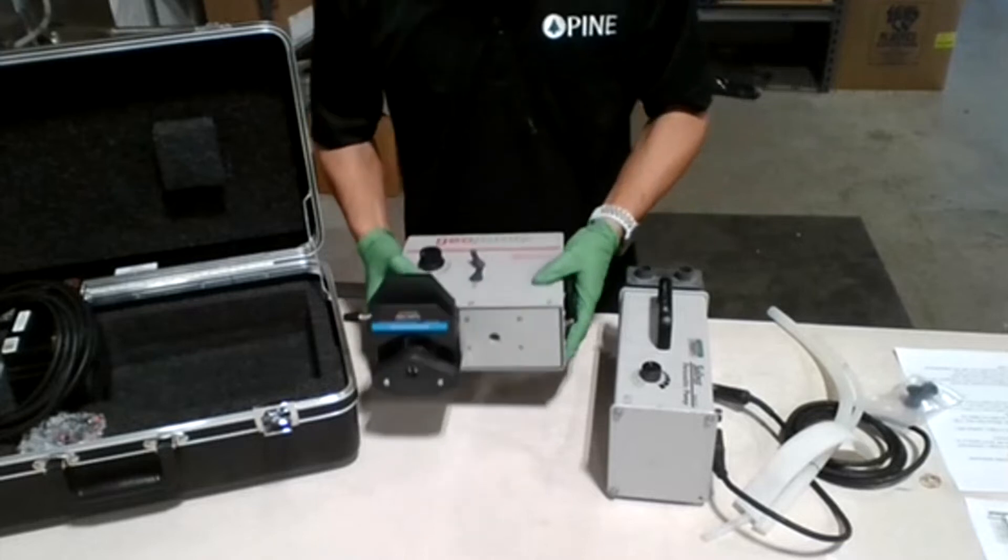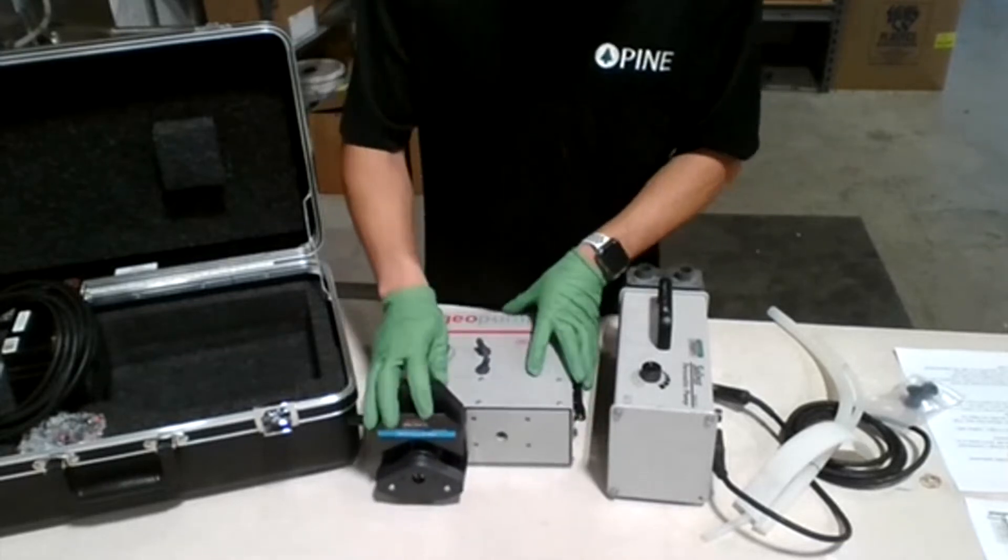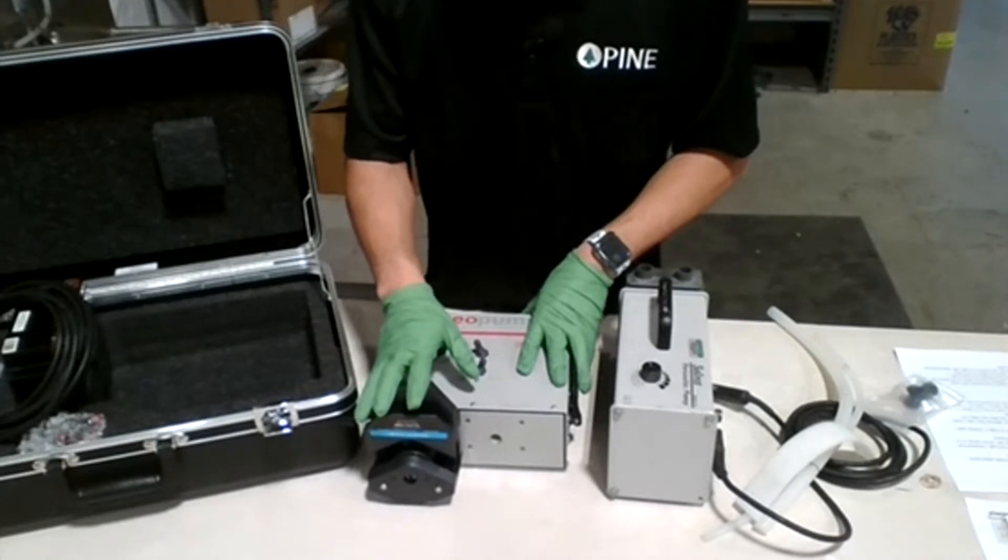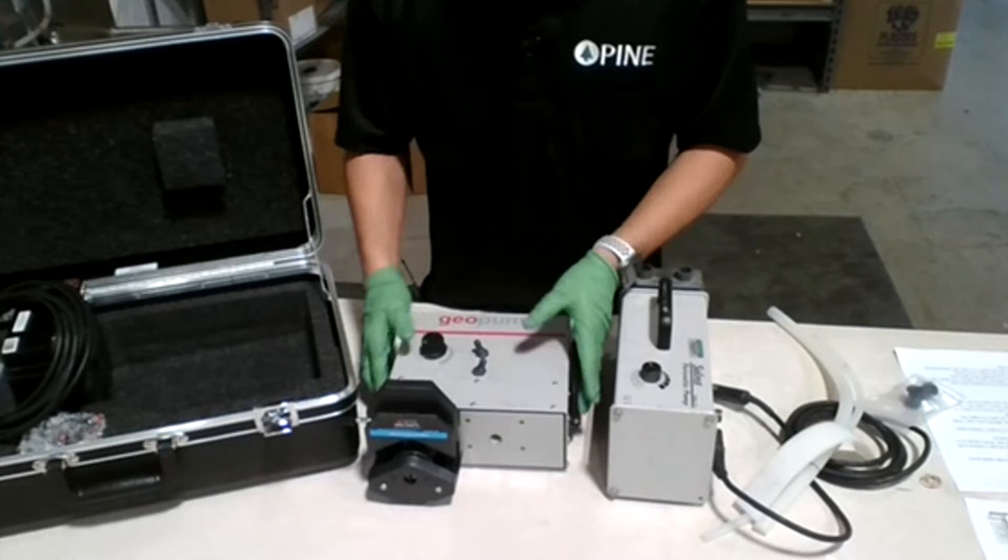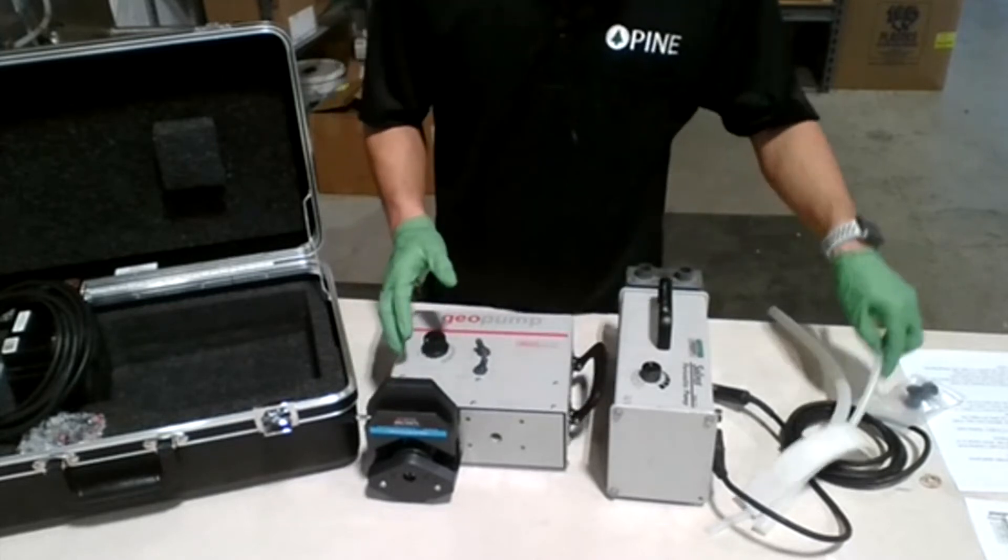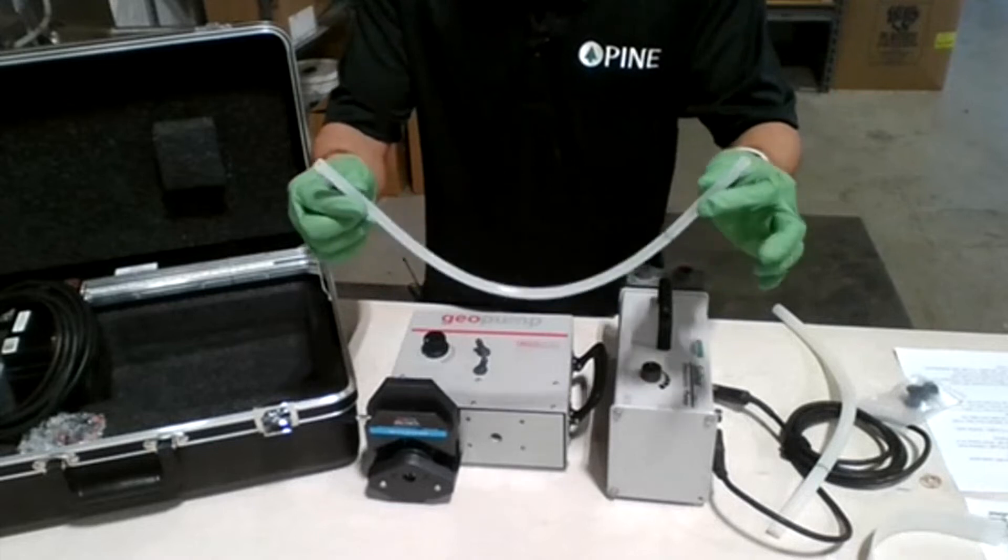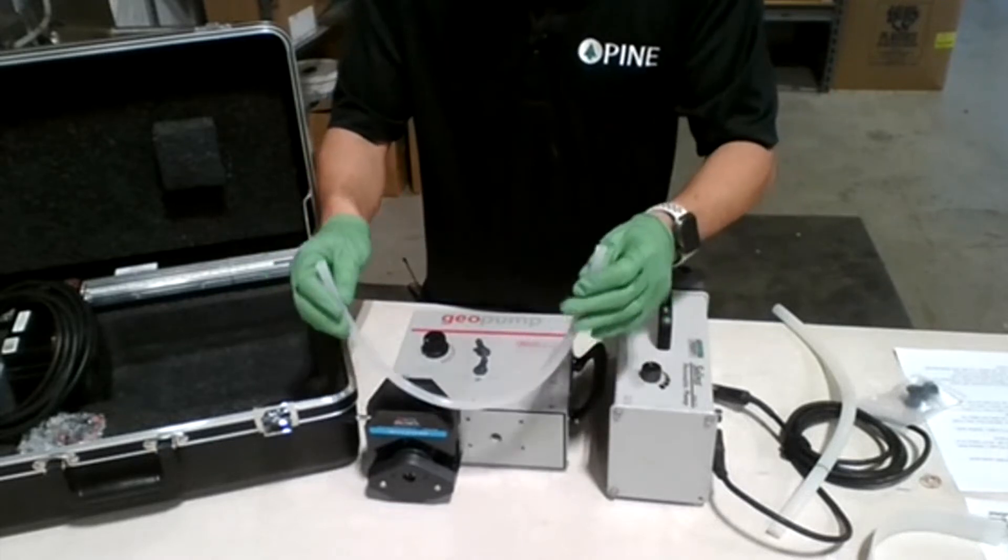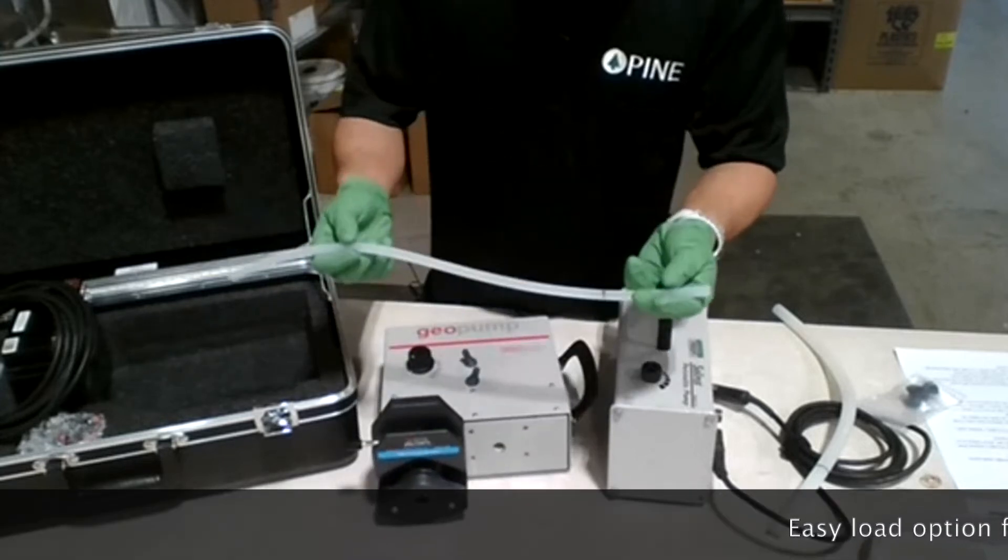How does it actually work? You can use different types of tubing, but we mainly carry flex tubing, which is silicon tubing. It mainly uses three-eighths inch tubing, just like this one here. This is the most popular one that we use - three-eighths inch tubing that goes inside.